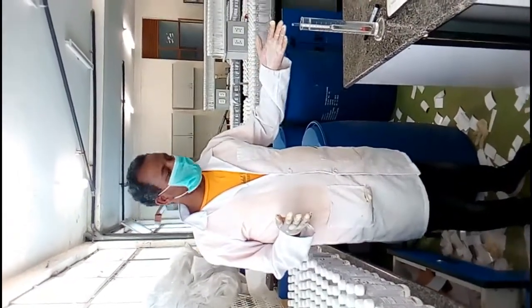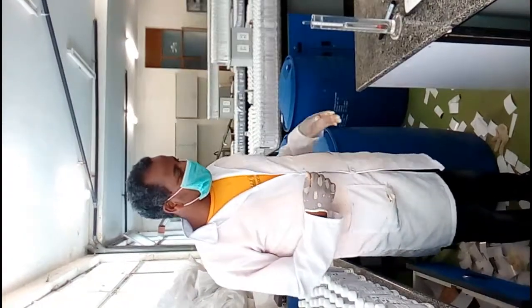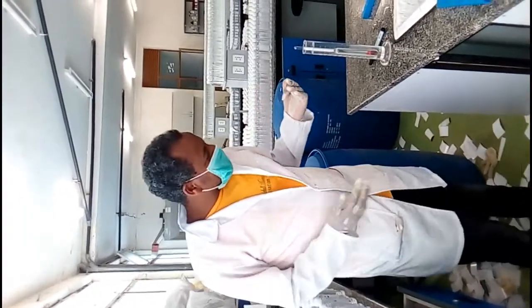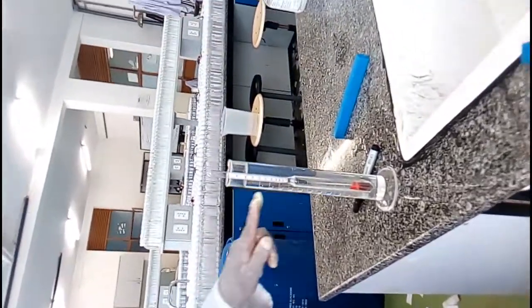Let's come to the final stage of our experiment. Now we are checking with the alcohometry using the sample taken from the sanitizer. As we said, it contains 80% ethanol. Let's come to the reading here. If you observe here, there are readings from 0 up to 100.